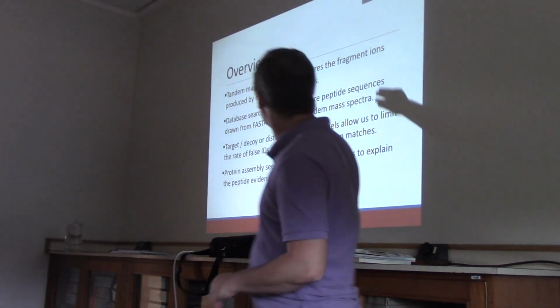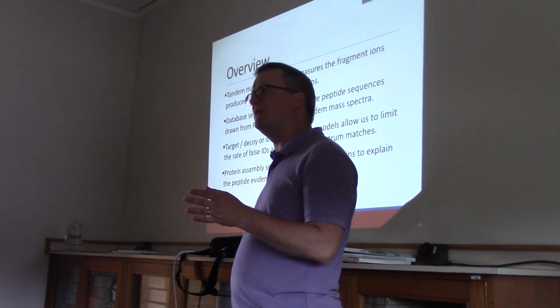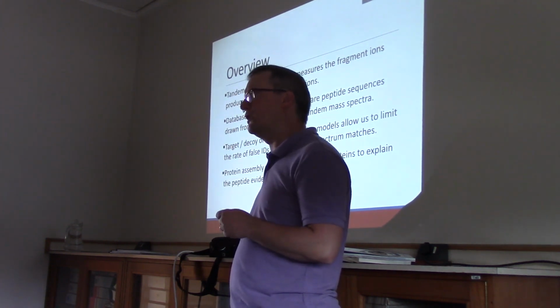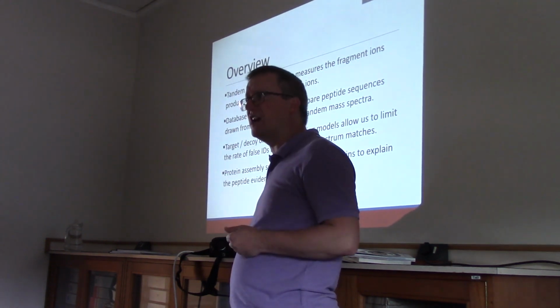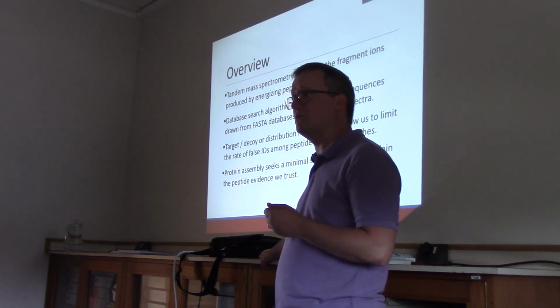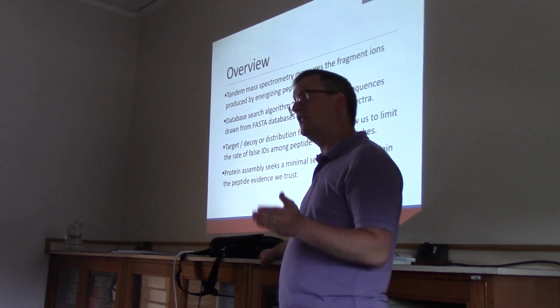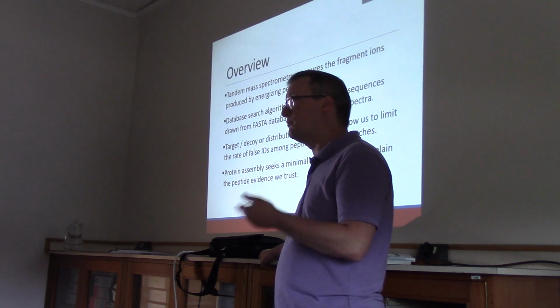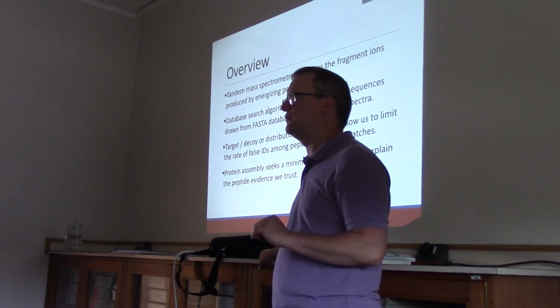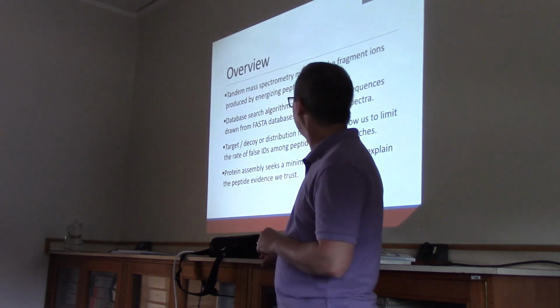So today we're going to start with an introduction to tandem mass spectrometry. I think rather more people have the basics of how DNA sequencing works than how protein identification works. So I'd like to try to explain the nature of the data that we're working from. We're going to talk about database search algorithms, which are the standard workhorse that pretty much everybody in the field uses. There are other ways to analyze data sets from proteomics than database search, but this is far and away the most dominant method out there. Almost any paper in proteomics will include the use of at least one database search algorithm.